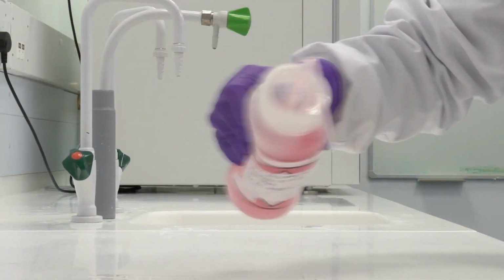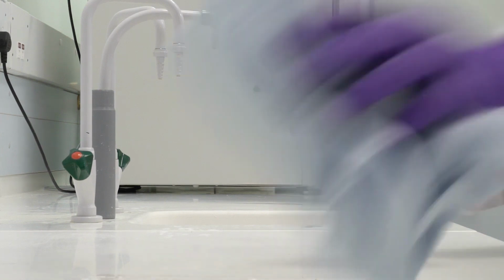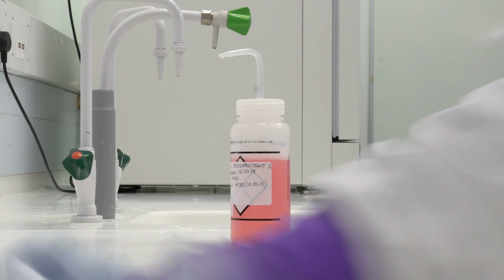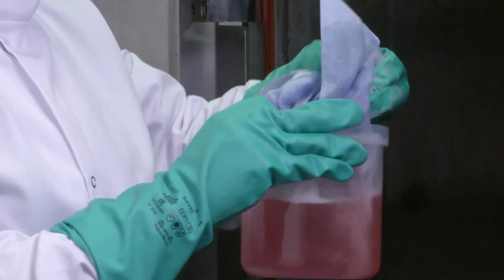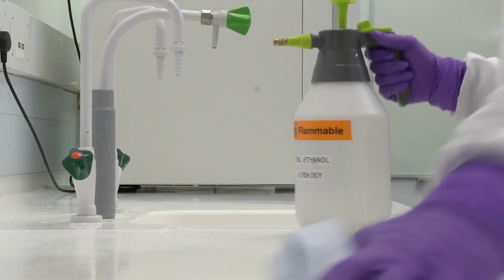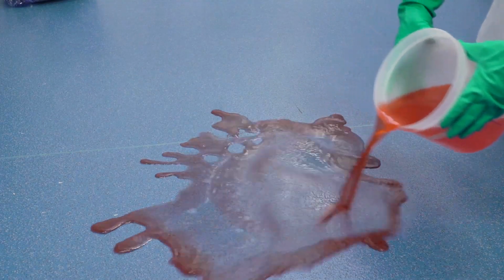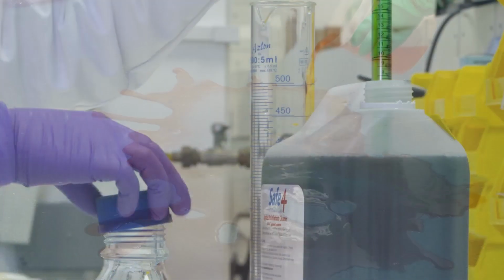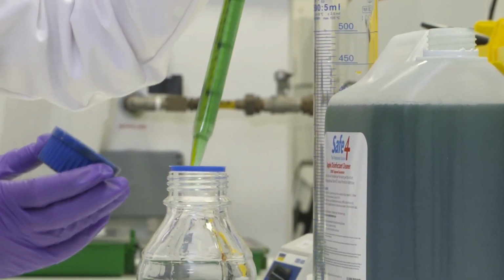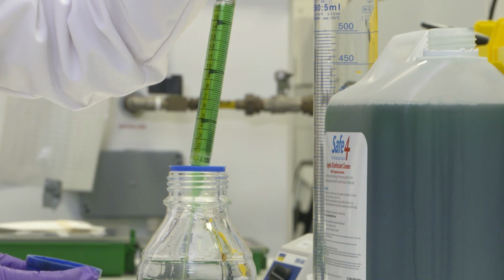Disinfectants, which are chemicals which can kill or neutralize biological agents, are often used for surface decontamination. The choice of disinfectant, its concentration and contact time will all vary depending on the biological agents you are handling. Surface decontamination is usually carried out using liquid disinfectant solutions.